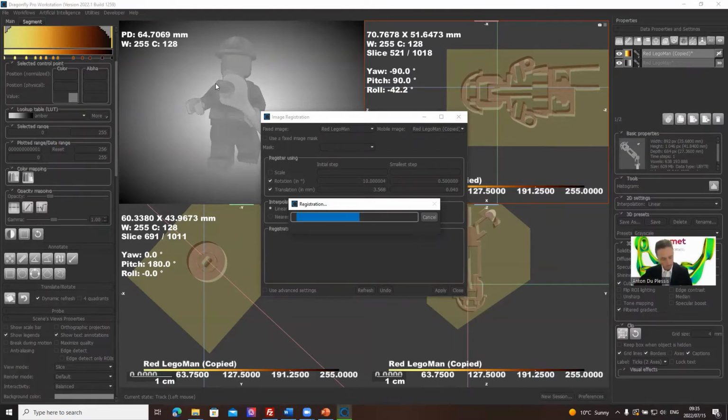So let me see what I need to just demonstrate. A little bit more windows leveling and some other shortcuts. And I've already demonstrated flip rotate, adding color. I need to spend more time on that. And data properties I need to demonstrate. So not very much longer in this video. Let's see how long this registration will take.